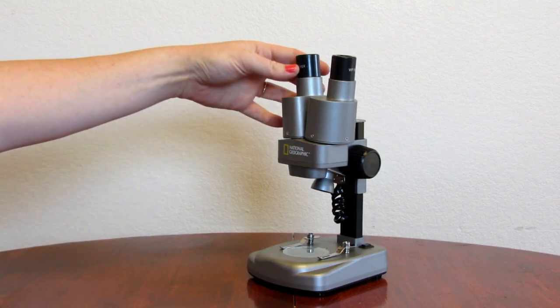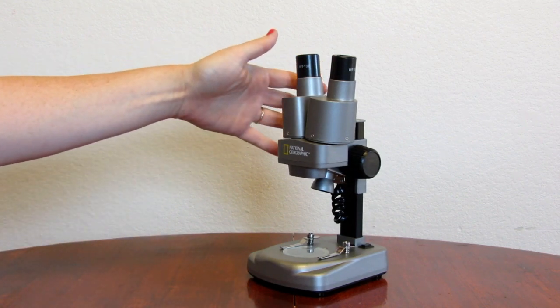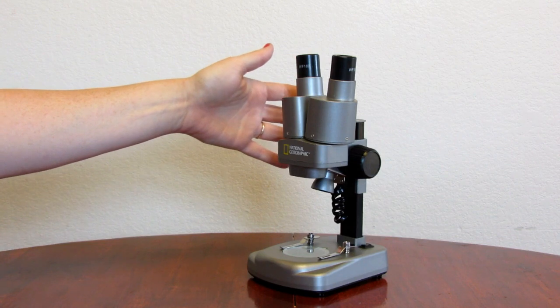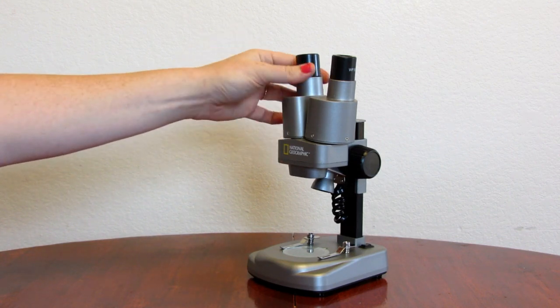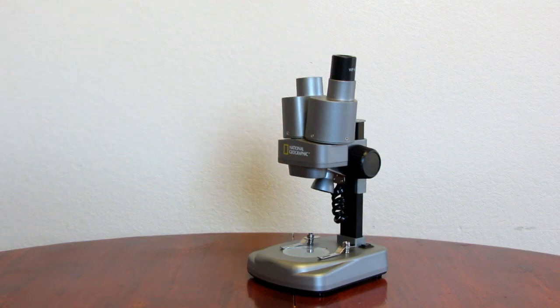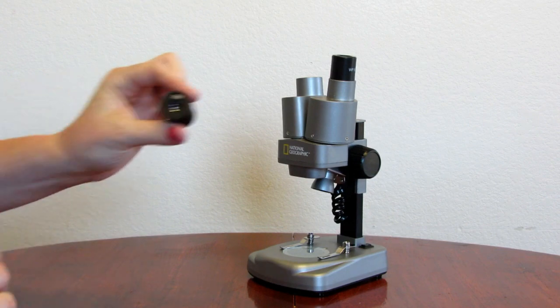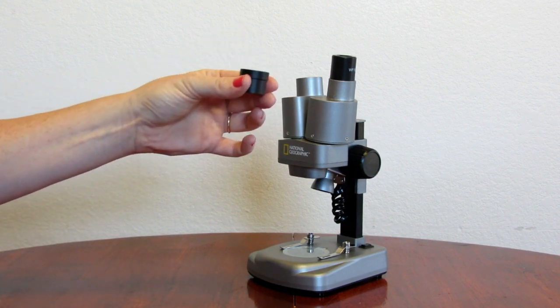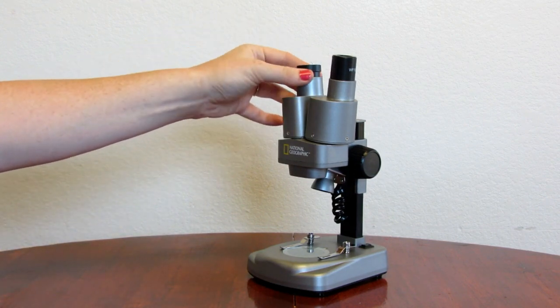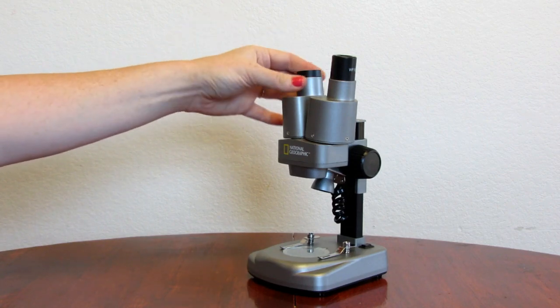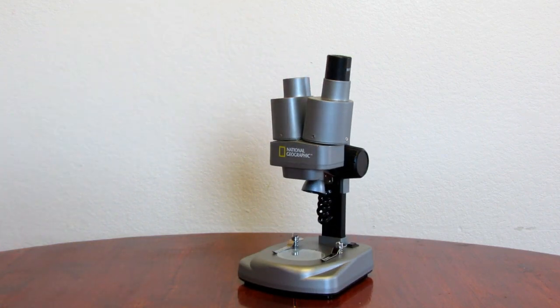You have your 10x magnification that is already in the microscope when you open it from the box. They give you the 25x magnification and you literally just have to place it in, so it's very easy to exchange lenses.